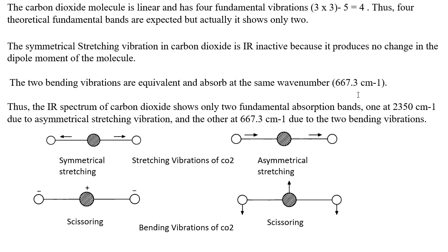The asymmetrical stretching vibration occurs at 2350 centimeter inverse, and the bending vibration at 667.3 centimeter inverse. And so two fundamental bands will be obtained in the case of carbon dioxide.